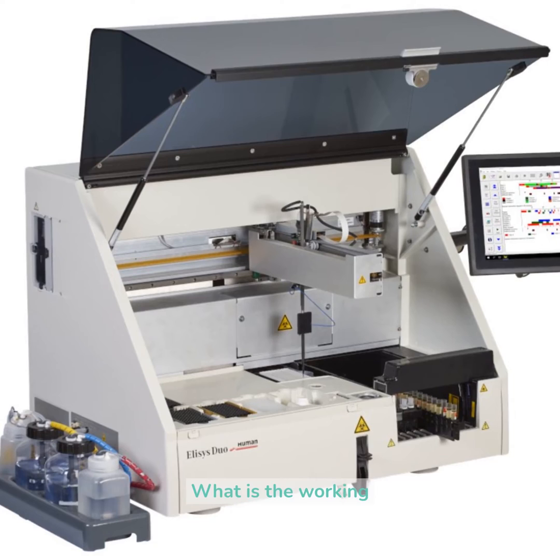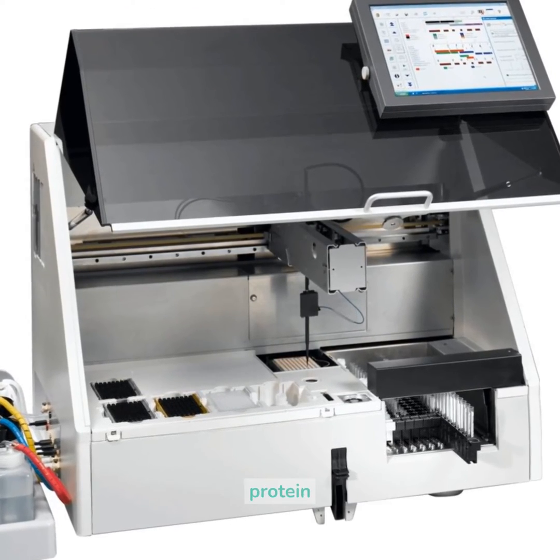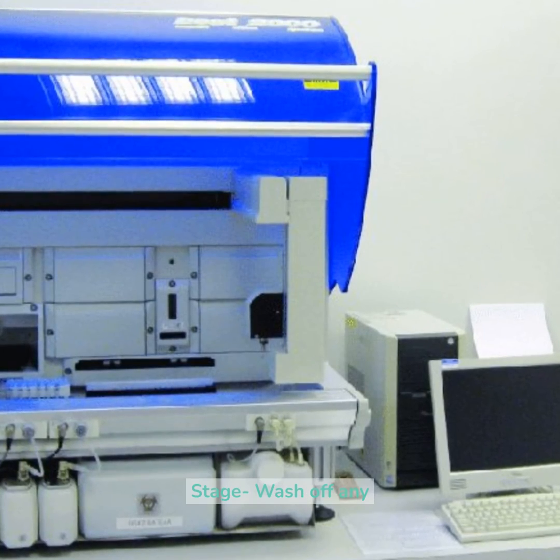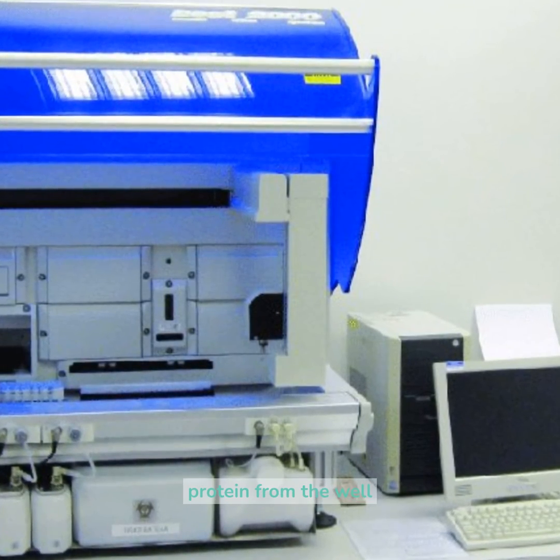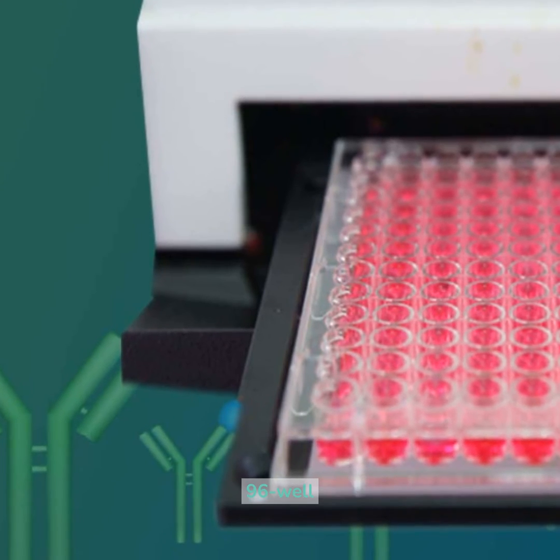What is the working process of ELISA? First stage: immobilization of the catch protein. Second stage: wash off any unabsorbed catch protein from the well surface. Third stage: block any unbound destinations on the 96-well plate.